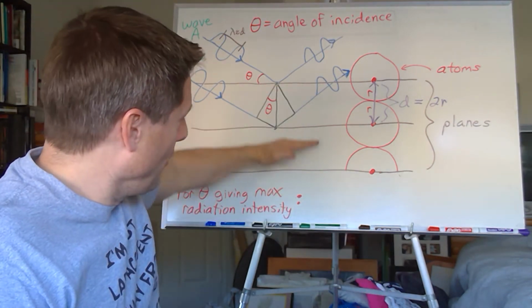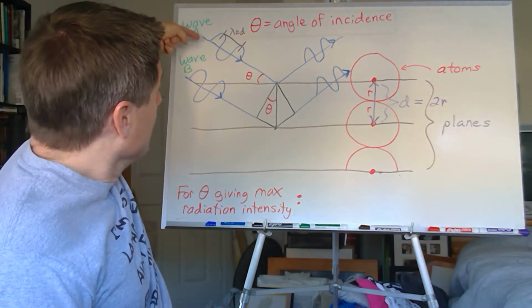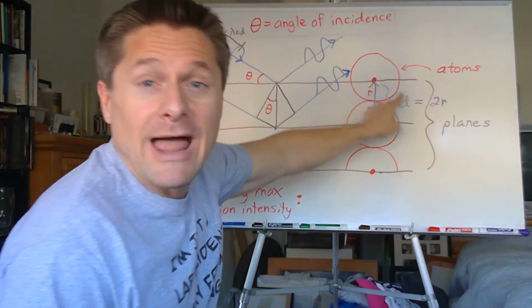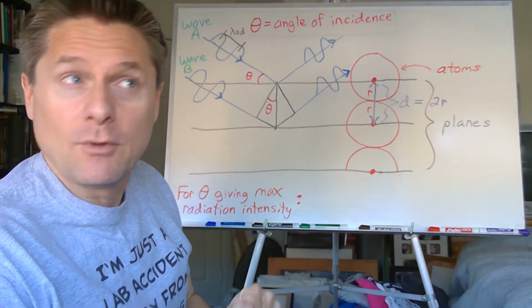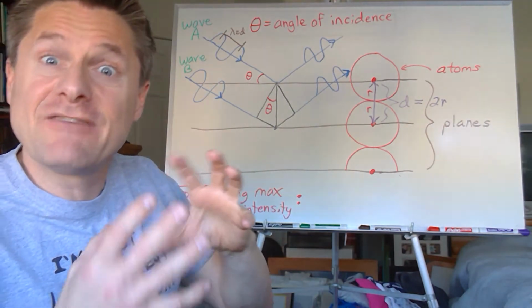I mean, there'll be more layers than this, but it's only the top layers that really matter in this situation. So say this wave hits the electron cloud of an atom on the top surface. Well, the electron cloud's polarizable, right? So it causes that to shift and move.